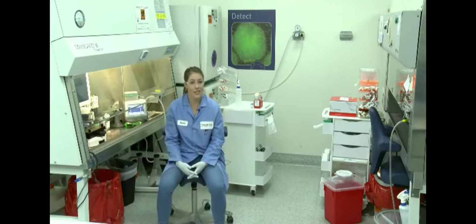I mean, that's always a concern with transfection, and particularly electroporation, because you're putting the cells under a lot of stress. But I touched on this earlier, laminin 521 paired with our StemFlex media, especially StemFlex media, will really up your cell viability post-electroporation. And then if you add RevitaCell to your media, that will increase your cell viability post-electroporation even more. Okay.